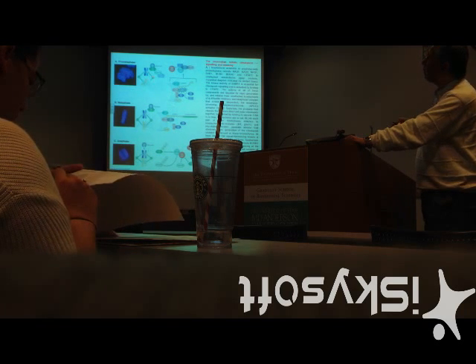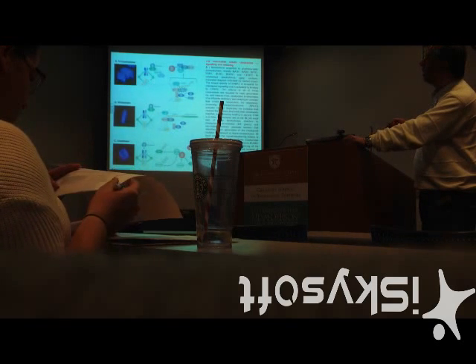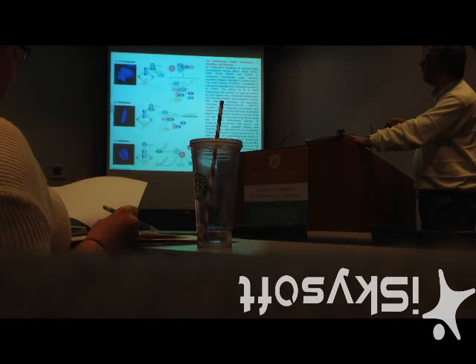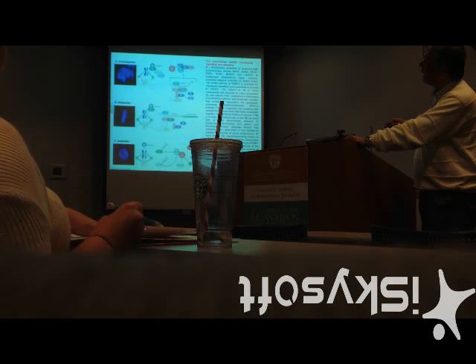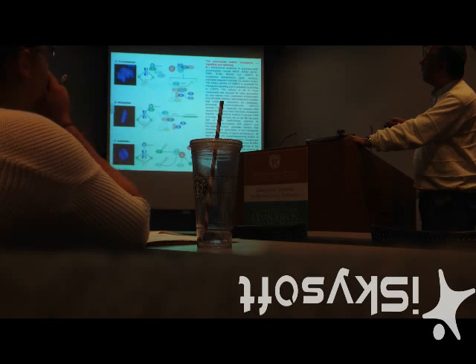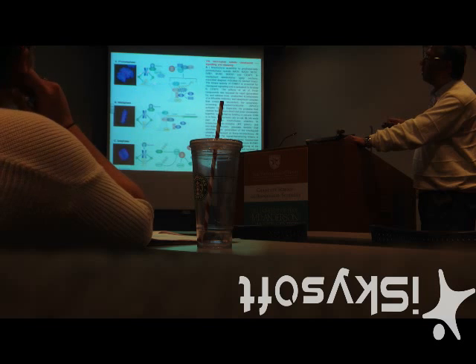So here, this chromosome, okay? If you just concentrate on this one, what you see is that the spindle microtubule has attached to only one kinetochore, right? As opposed to this chromosome, where the sister kinetochores are attached to both ends.